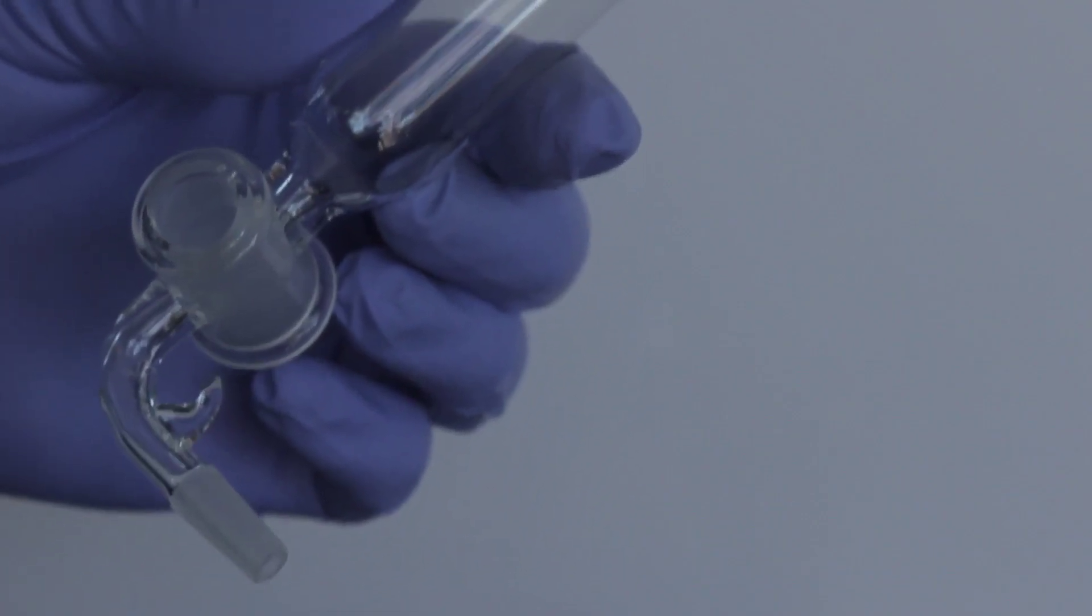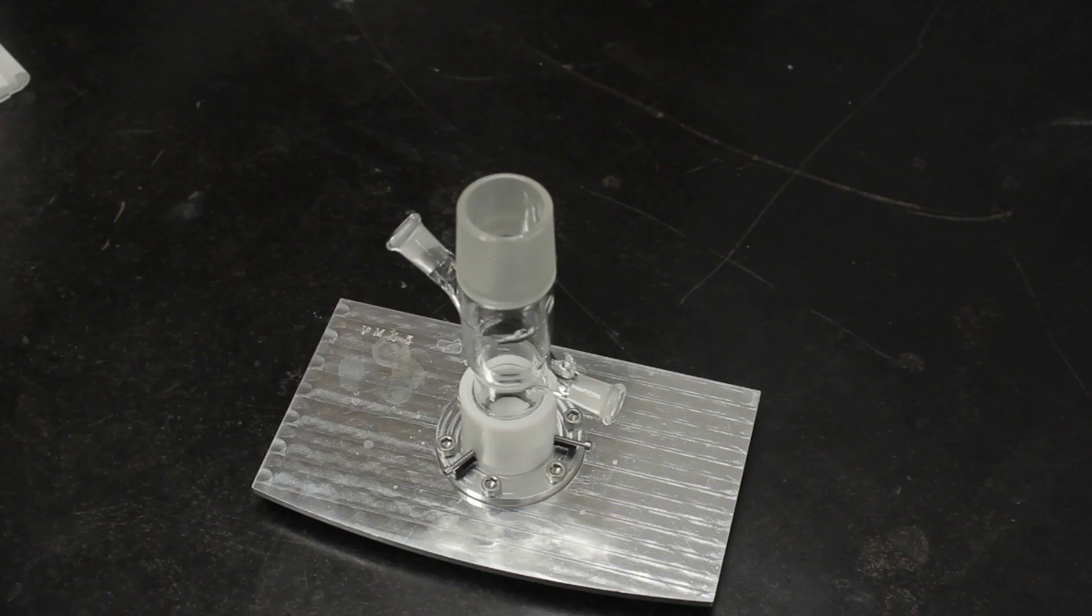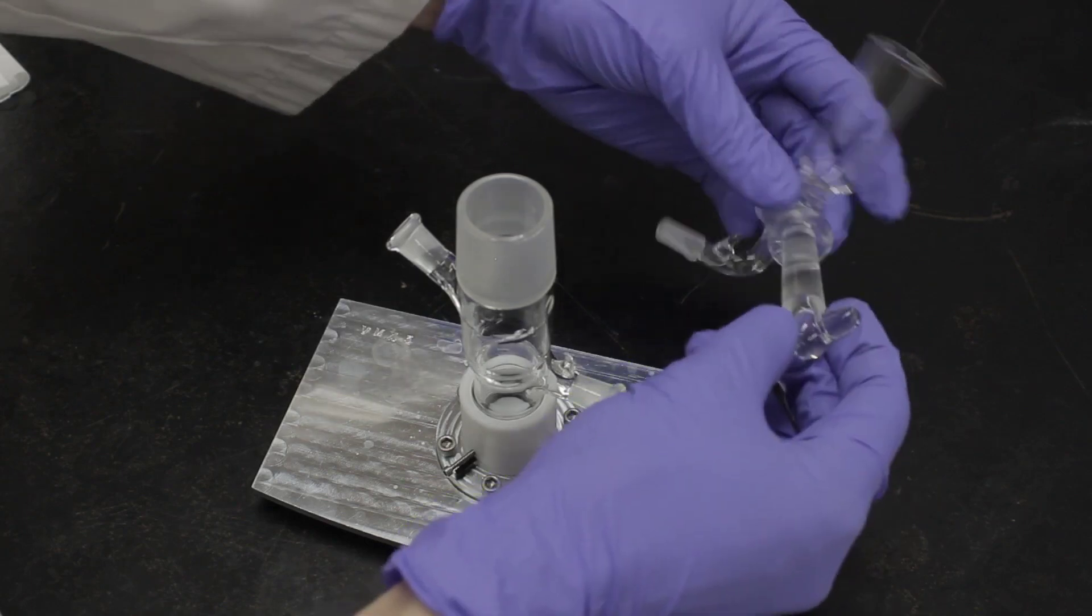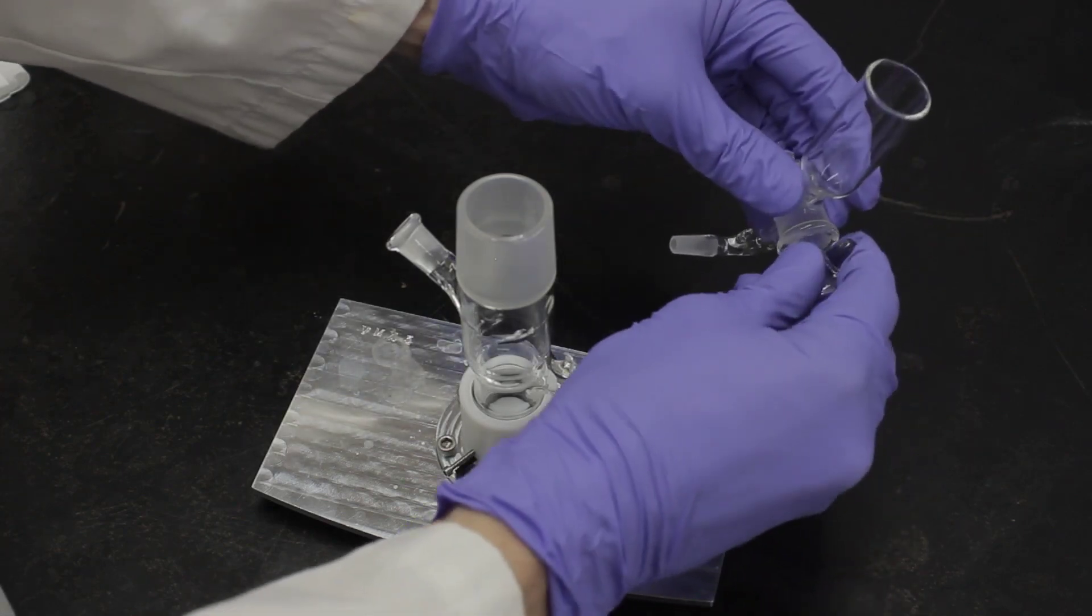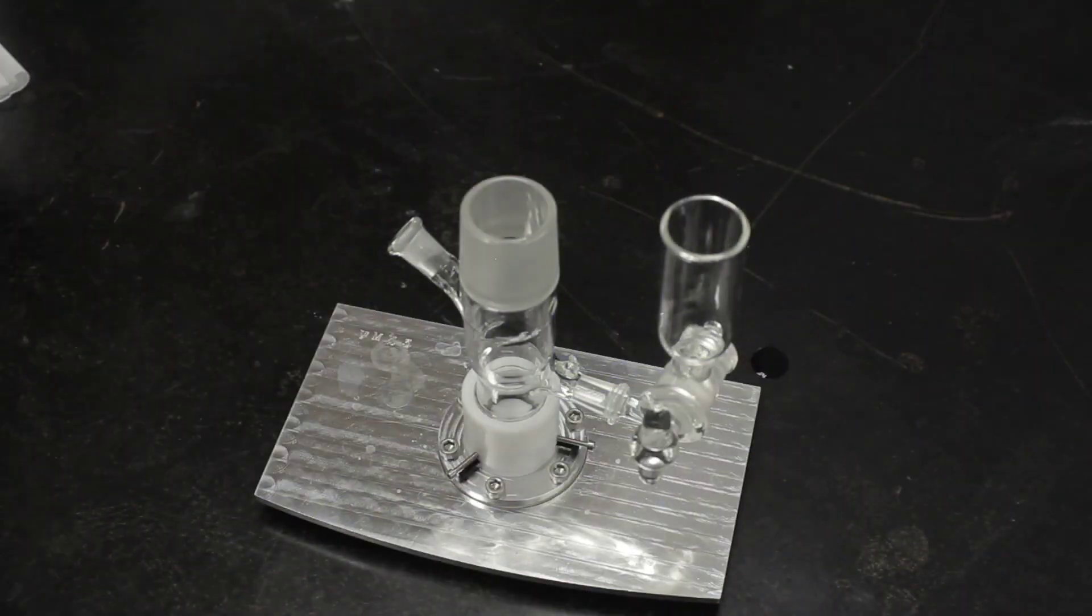When attaching the ground glass joints, wet the surfaces with millipore water. This helps them to seal and also prevents the joints from seizing. First, insert the stopcock into the reference arm. Make sure that the stopcock is open. Attach the reference arm to the main cell body and secure it with the spring.